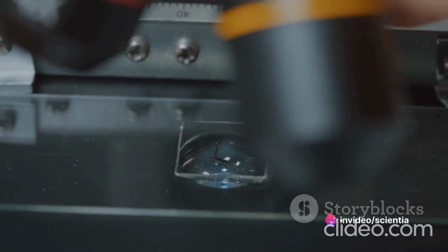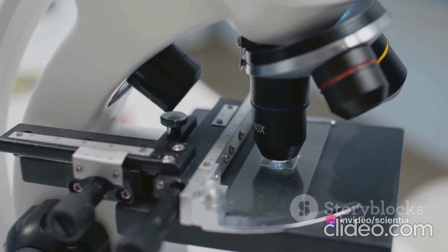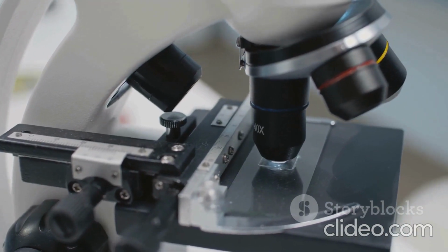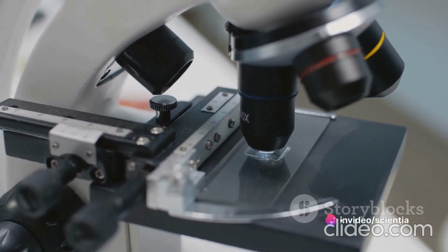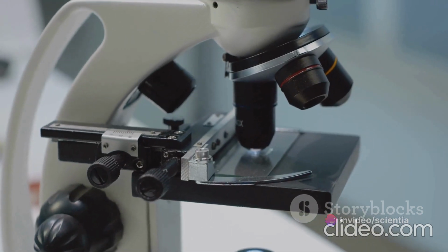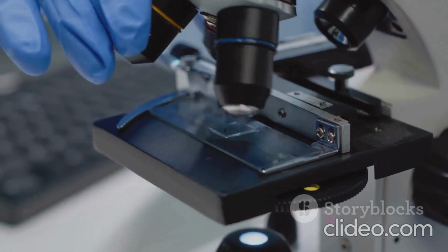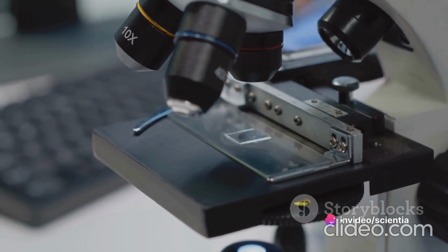The most recent addition to the family of microscopes used in diagnostic laboratories is the fluorescence microscope. This specialized microscope uses fluorescence and phosphorescence instead of reflection and absorption to study properties of organic or inorganic substances. This has been instrumental in the detection of specific proteins, DNA sequences, or other biomolecules in a sample, thus aiding in the diagnosis of various conditions, including cancers and genetic disorders.